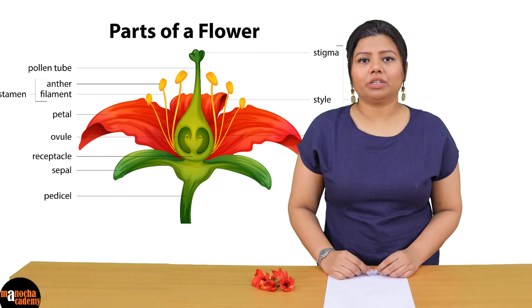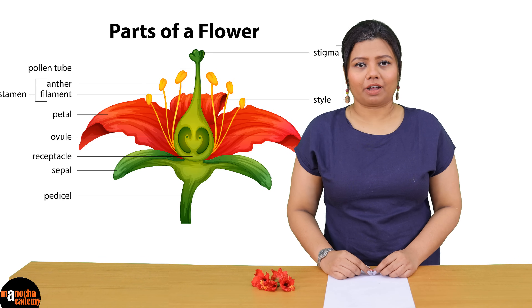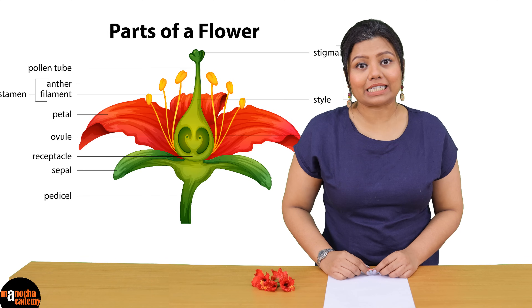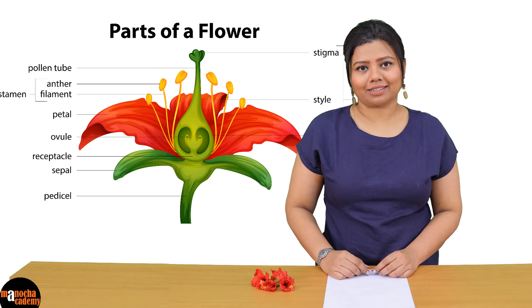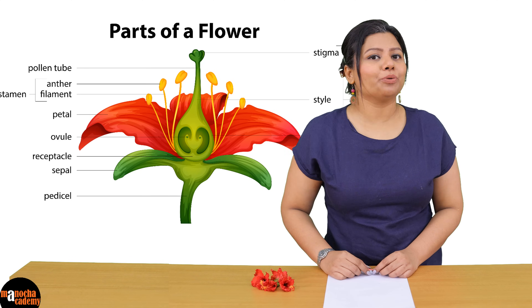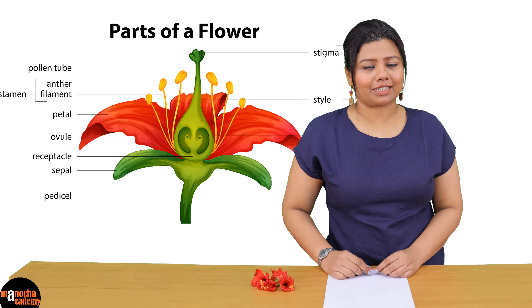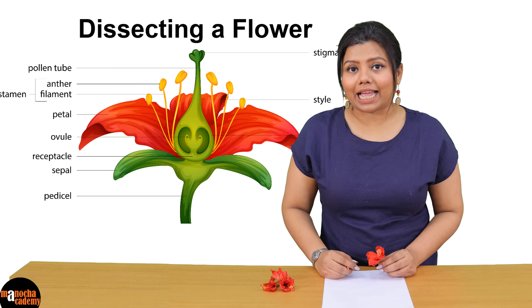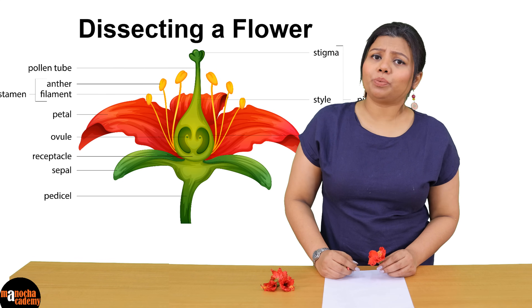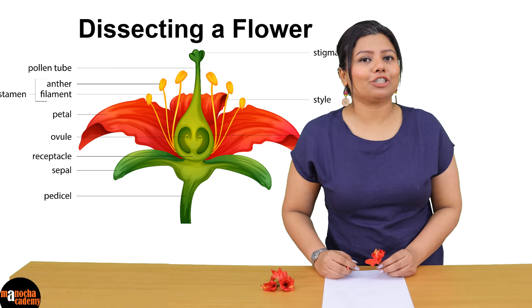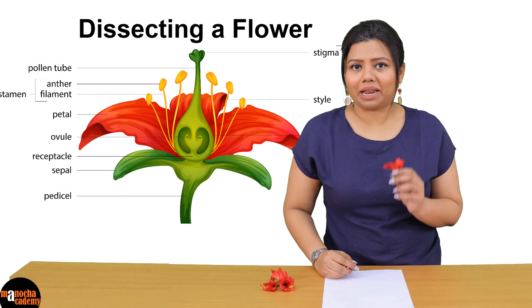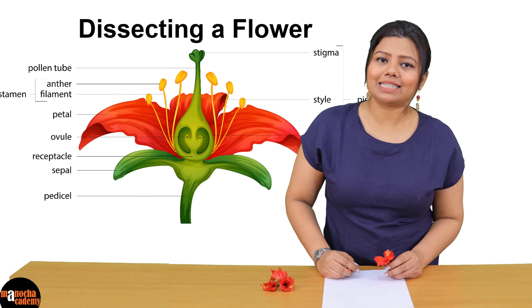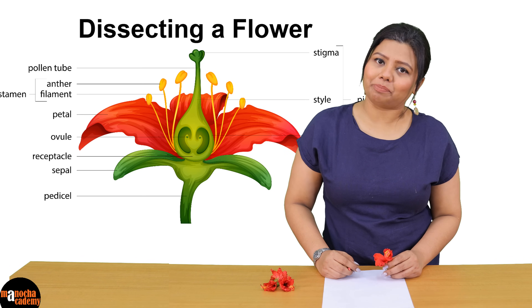You have all learnt about the different parts of a flower, but have you ever dissected a flower and seen what is actually inside it? In today's class we are going to do exactly that. We are going to take a flower, dissect it and see that what we have learnt in our theory actually holds good in practical. So let us see how we can dissect this flower and separate the different parts.